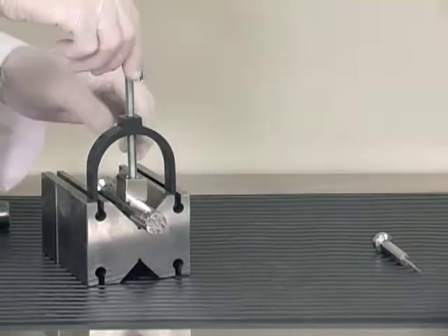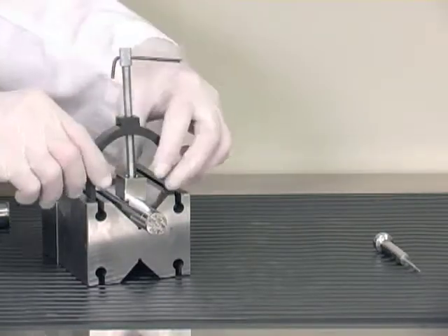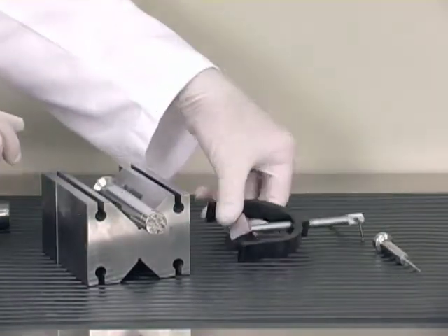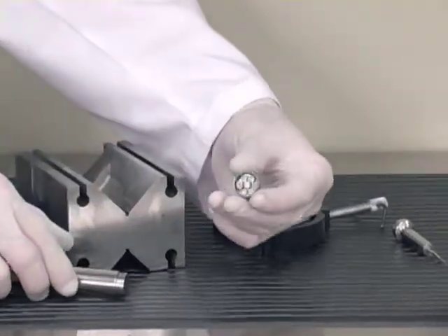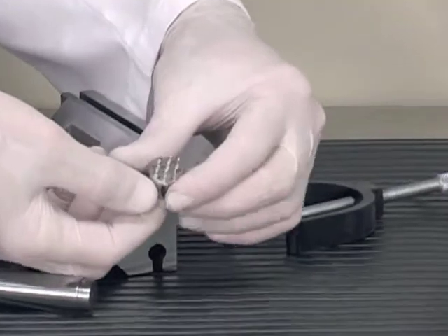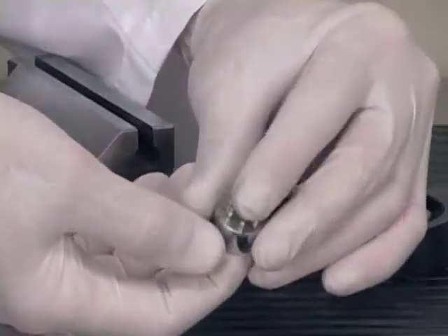Now we remove the punch from the v-block and we remove the cap from the punch. Then we remove the inserts from the cap.